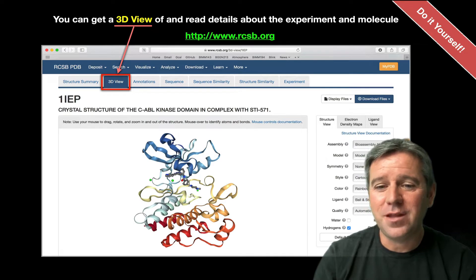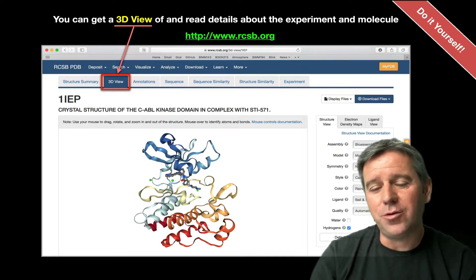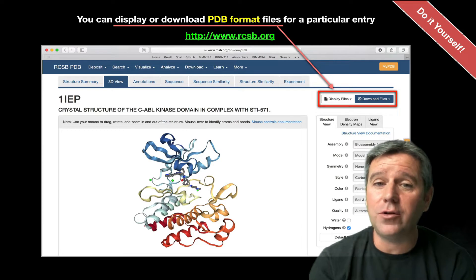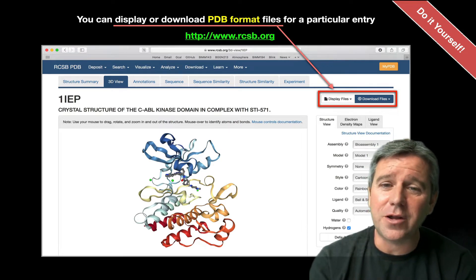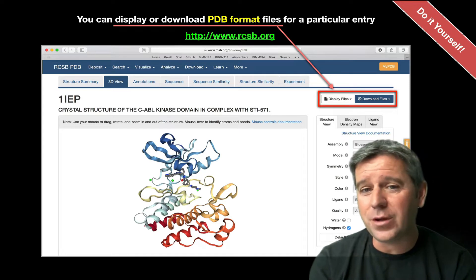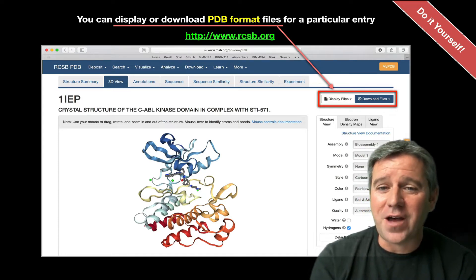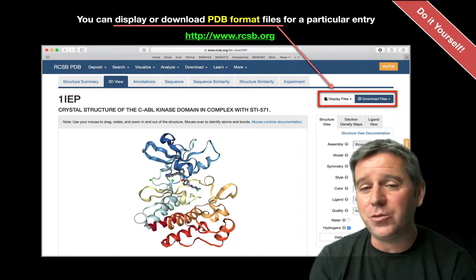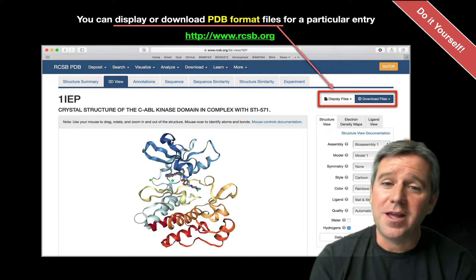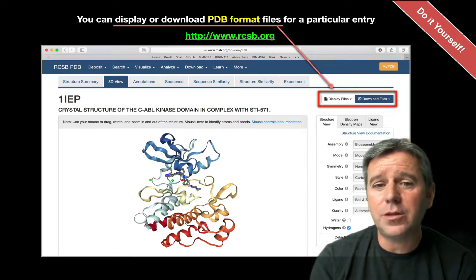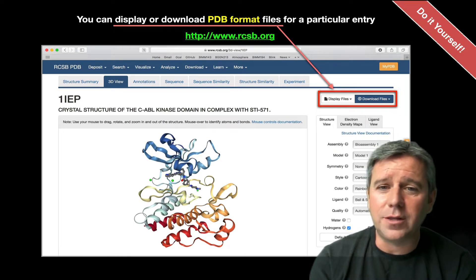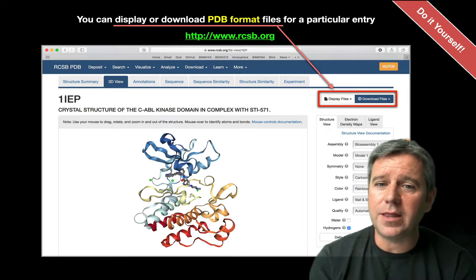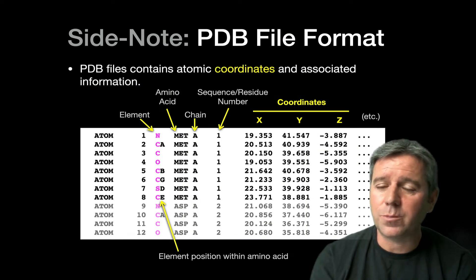When you're on this page, click where it says 'Display Files' or 'Download Files.' The file format we're looking for is called the PDB format — the ubiquitous format used for conveying biomolecular structural information. There are other formats like mmCIF that may be better for file size, but PDB is so widely used that it predominates. I'm going to display that file here, zoomed in on a particular section.